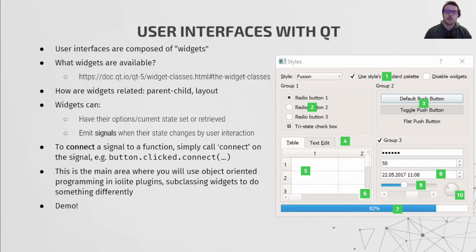Layouts help to organize the widgets into a window in a particular way that will respond when the window is resized. Qt comes with several layouts, including a QFormLayout, a QVBoxLayout, which lays out widgets vertically, and a QHBoxLayout, which lays out widgets horizontally. Every widget has a layout, and layouts can be nested. Obviously, this can get pretty complicated, but for the simple settings dialogues we will be making today, it shouldn't be too overwhelming.